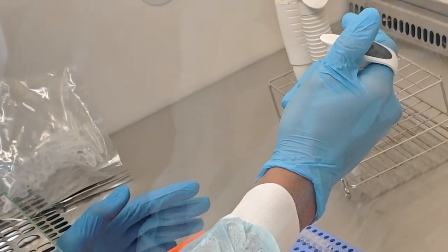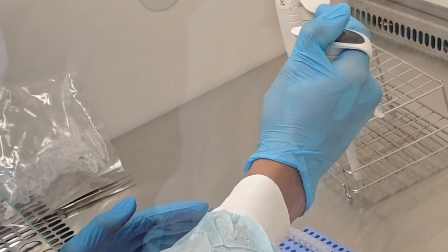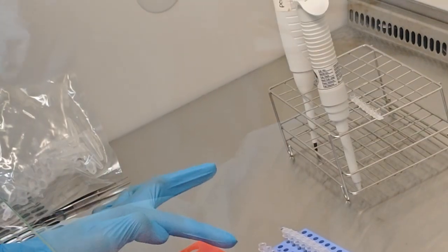Yeah, you can make a drop on the side of the wall, and you can make sure this well has been at template.